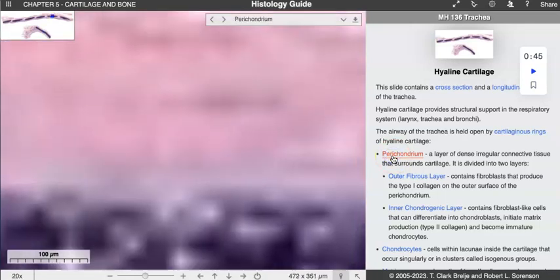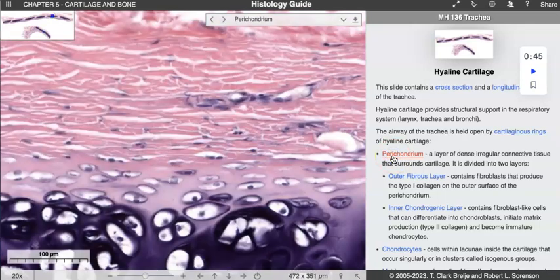So if we even click on this, let's see where it takes us. All right, to that connective tissue surface. And again, look at all of these lovely chondrocytes, right? We also get into the outer fibrous, which is going to be where we find lots of fibroblasts.